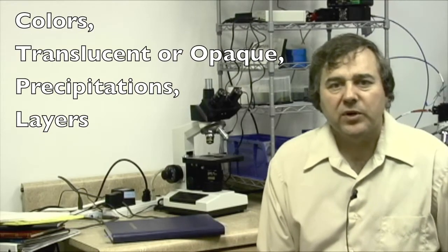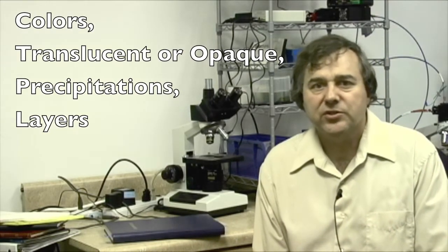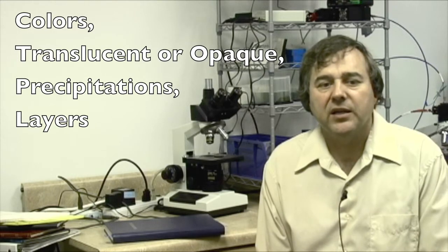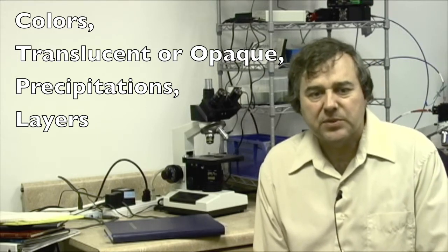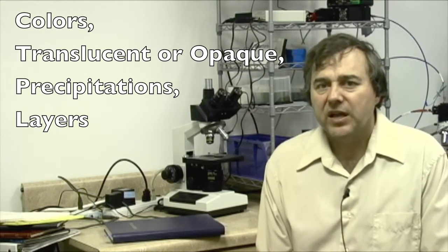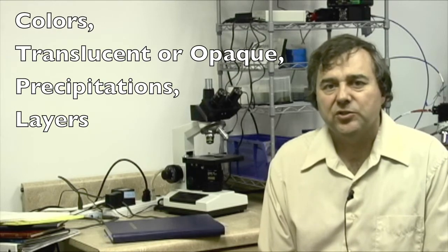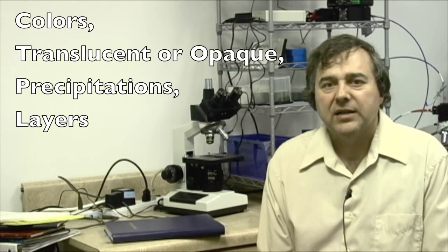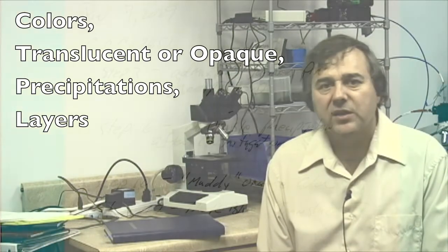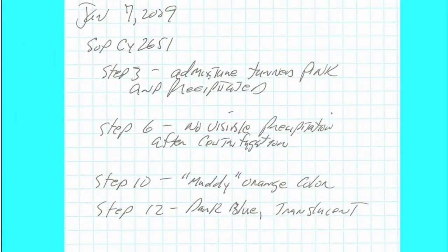When making a reagent, note the colors, whether it's translucent or opaque, clear or cloudy. Note the formation of any precipitants. Note the formation of layers - for instance, if you have a separation into a top layer and a bottom layer, that could be important in the long run. It indicates there's a lack of solubility. Note the approximate times when a change was observed.